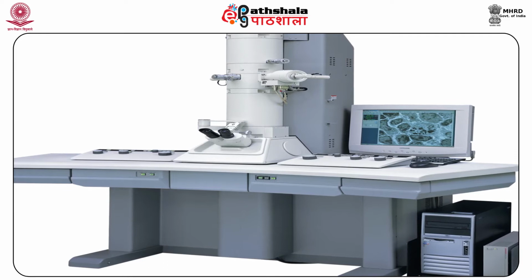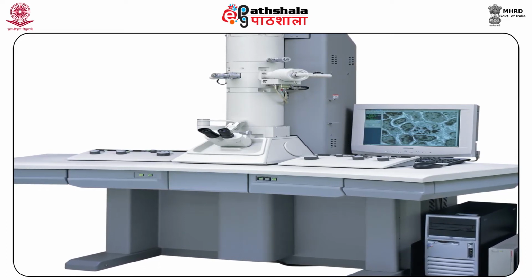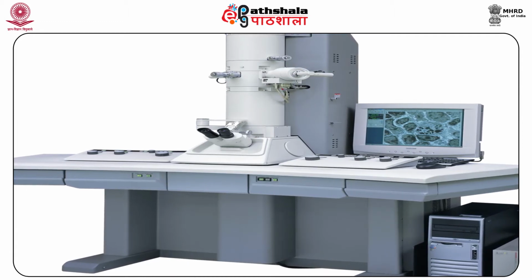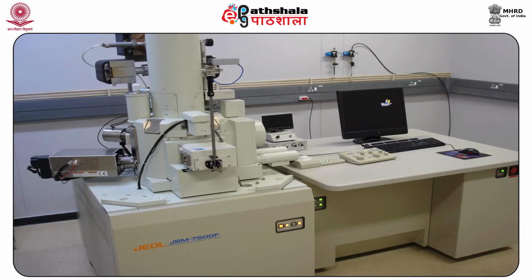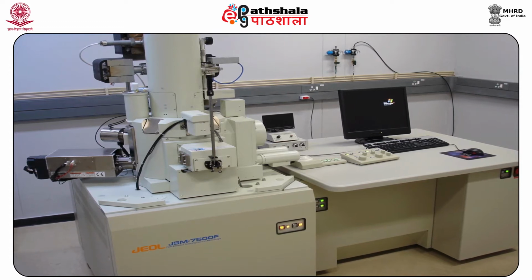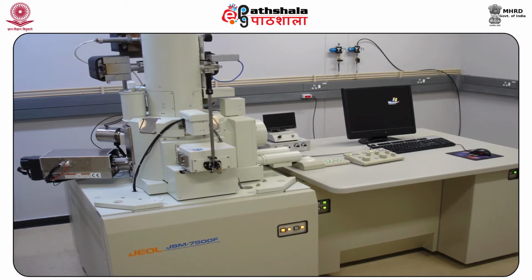Now, the electron microscope has high magnification. In certain cases, the magnification achieved can be up to 2 × 10^5 times. It is extensively used in the field of biology and other material sciences. In scanning electron microscope, a three-dimensional external shape of an object with greater depth of field can be obtained.